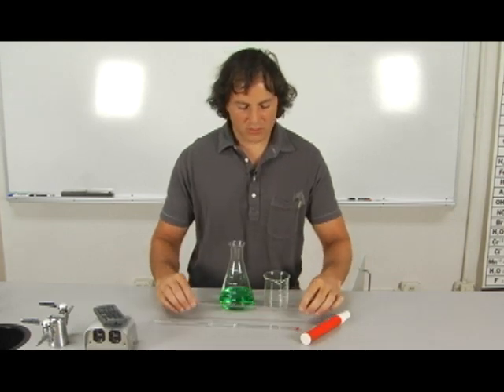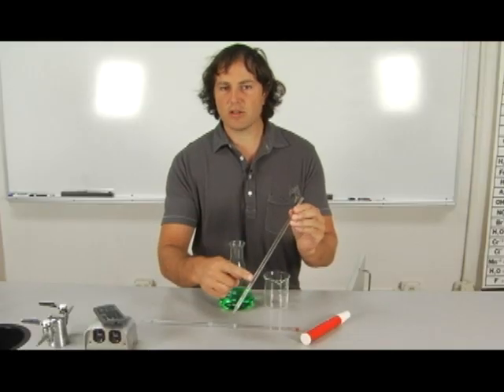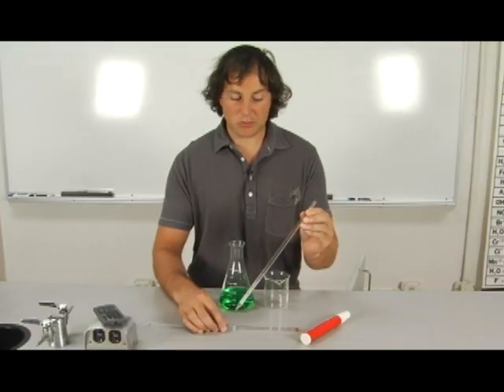The Mohr pipette is more versatile but less accurate. It's more like a graduated cylinder that's more accurate than a graduated cylinder though.